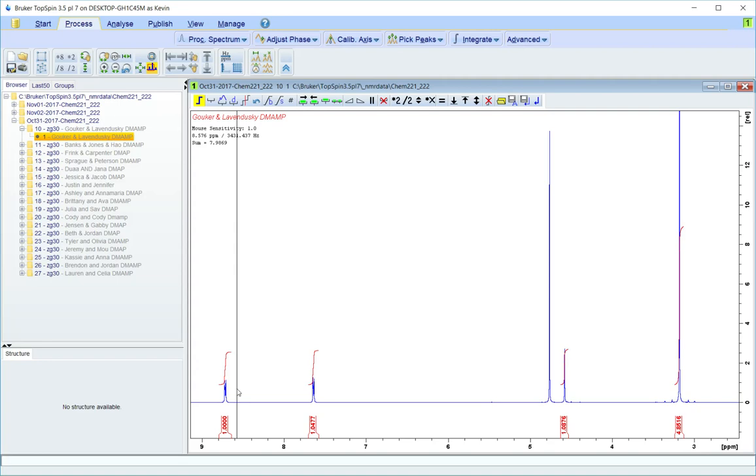And so you have to do some thinking about the possible molecules you're making. So if you predicted a particular major product, then think about, for example, what group of protons in that predicted product would this peak represent? Okay, so for example, peaks that show up kind of in this 6.5 to 9.5 region down in this part of the spectrum are often protons on aromatic rings, like benzene rings.